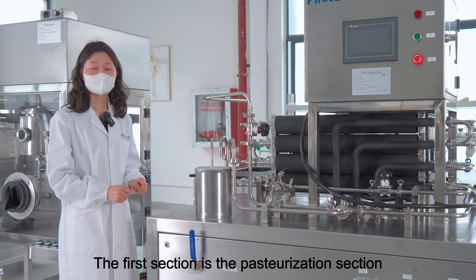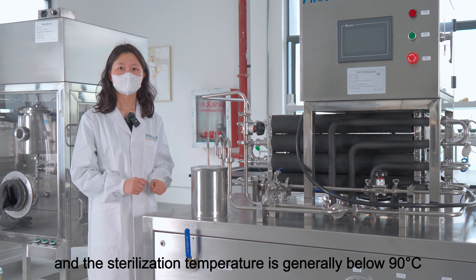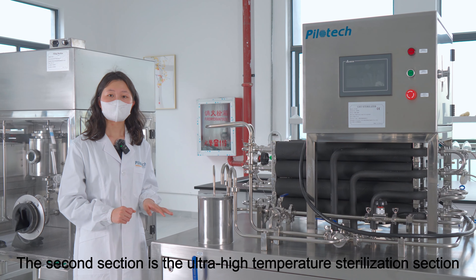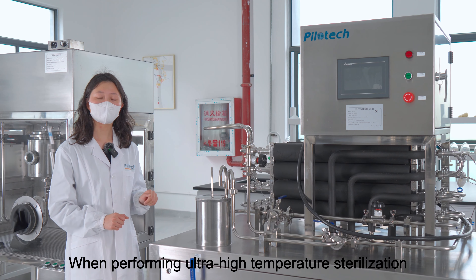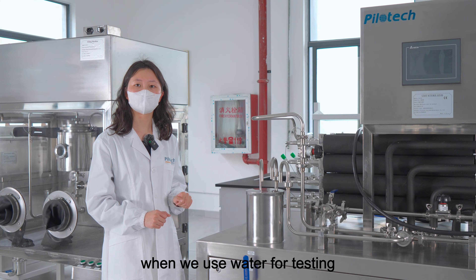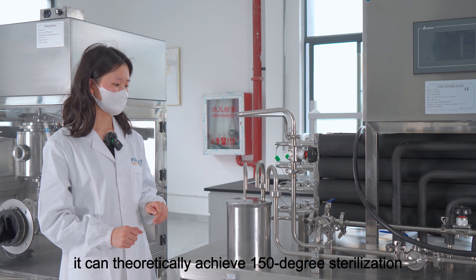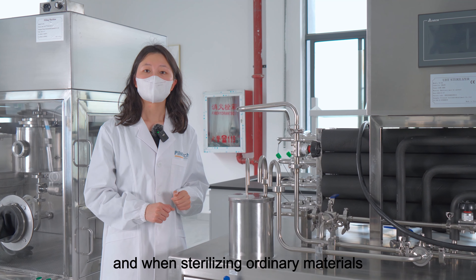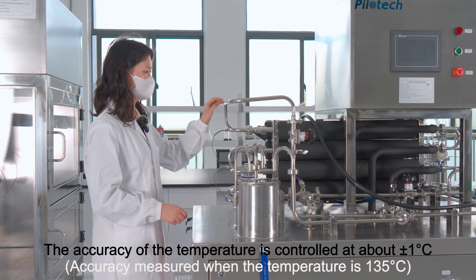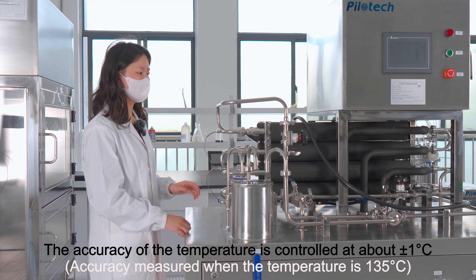The first section is the pasteurization section, and the sterilization temperature is generally below 90 degrees. The second section is the ultra-high temperature sterilization section. When performing ultra-high temperature sterilization using water for testing, it can theoretically achieve 150 degrees. And when sterilizing ordinary materials, the highest temperature is 142 degrees. The accuracy of the temperature is controlled at about plus or minus 1 degree.